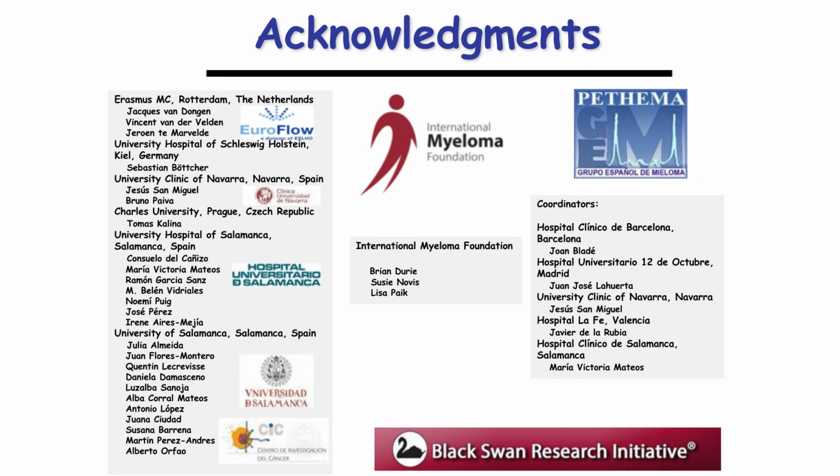Do you perform the MRD panel on every follow-up case, or do you have a less sensitive panel to screen for overt relapse disease before performing the MRD panel? Well, this is also a very important question, and I think that not always do we get enough information from the samples when they are sent to our laboratories.